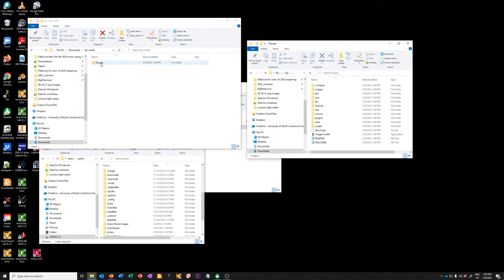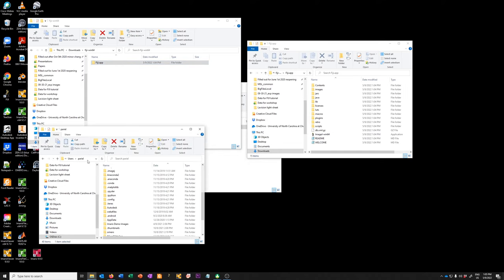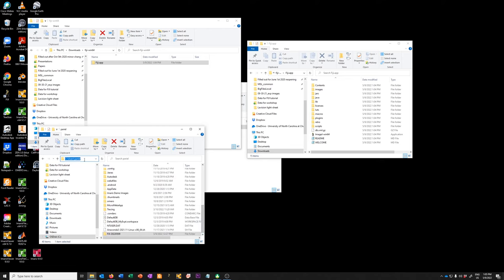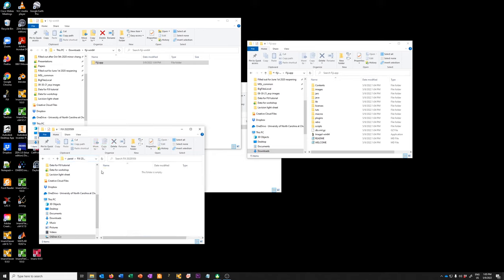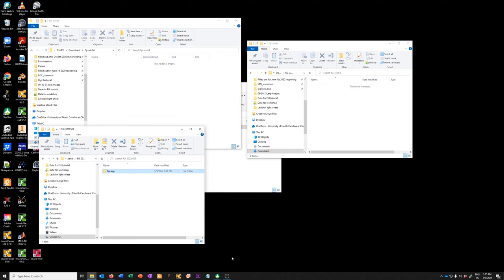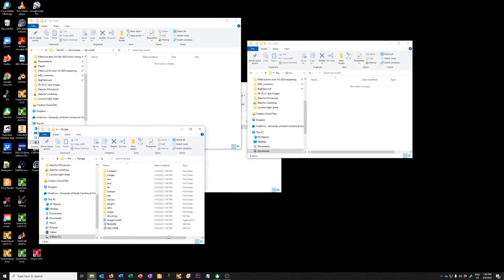I don't want to run Fiji from the downloads folder. I want to put it somewhere more logical. If you're on a PC, go to C:\Users and your username. I've created a folder within my user space called 'Fiji' with today's date just to keep track, since I have other versions of Fiji on my computer, so I'm going to put it there.